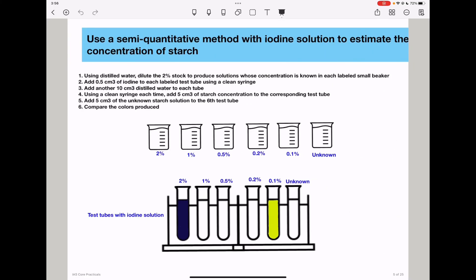In the demonstration, you will have six beakers for the different concentrations of starch solution and one beaker for the sample you suspect to contain starch. You will lay out six test tubes — one for the unknown concentration and the others corresponding to specific starch solutions. You begin by putting iodine into the test tubes, then adding the starch sample, and allowing them to interact. You will then compare this sample with the other five standards to see where the color lies along the spectrum you have created, in order to estimate the concentration.